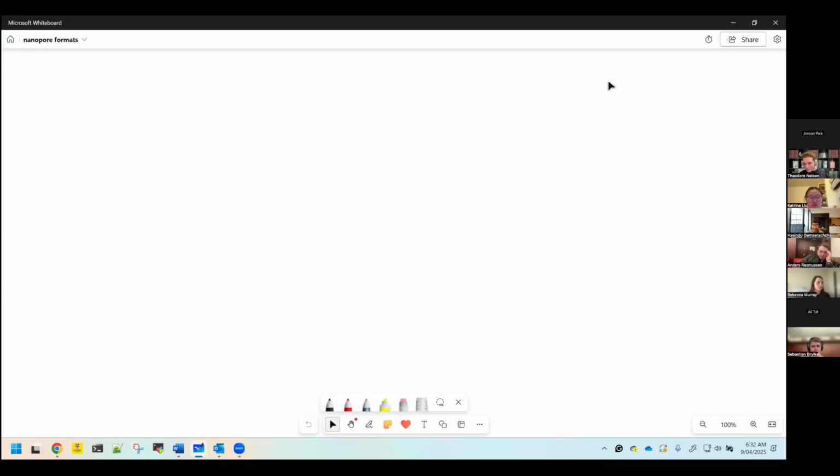Yeah, so as you know, nanopore sequencers are pretty cool things, especially that I can have one at home and show it to you like that. It's a small sequencer. But of course, there's the PromethION, which is a large sequencer. But whatever it is, let's say, can you see what I'm drawing? Yes, we can. Let us assume now this is the nanopore sequencer we have.